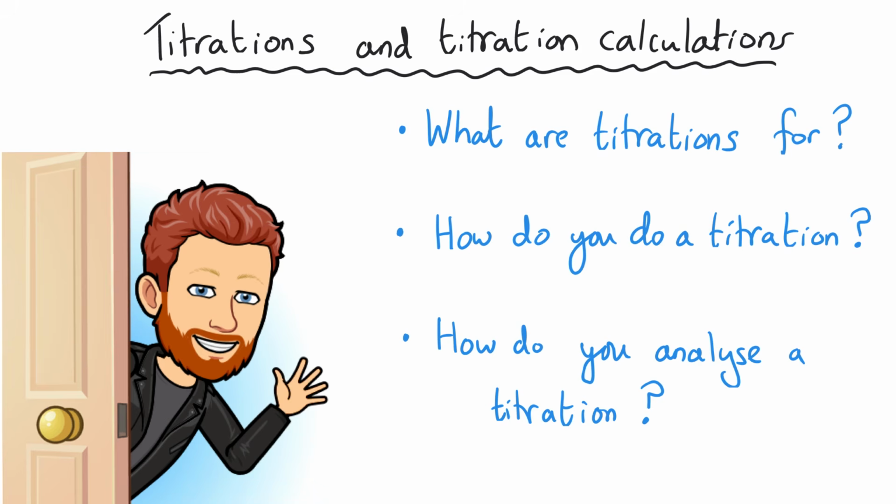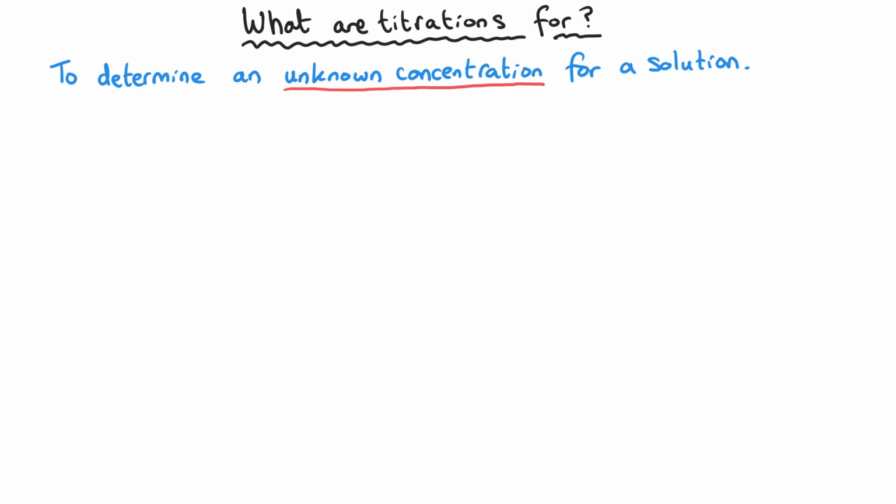What we're going to be focusing on today is titrations and titration calculations. We will be looking at what titrations are actually for, why do we do them. We'll look at how you actually do a titration because you need to know that method inside out. And finally, we'll take a look at how you actually analyse the results you get during a titration.